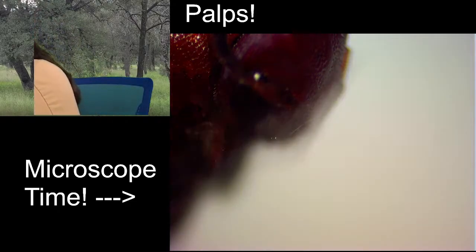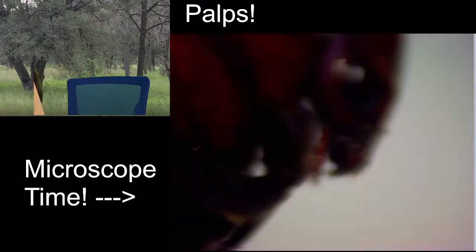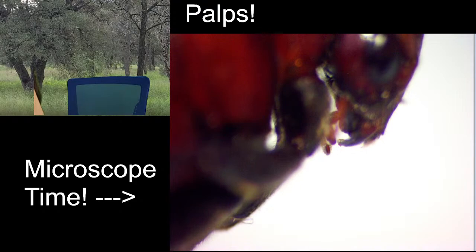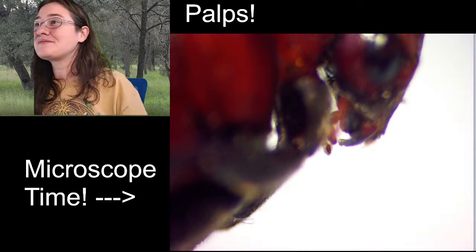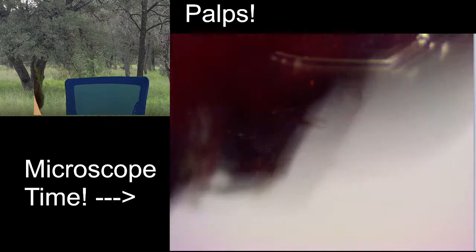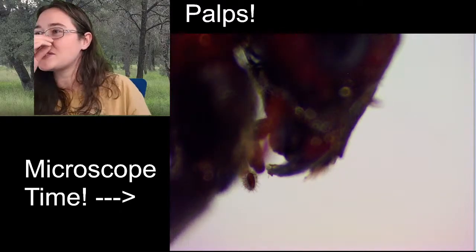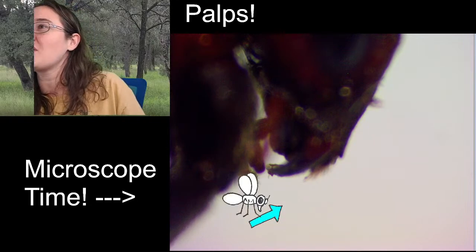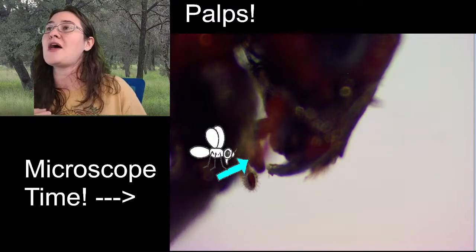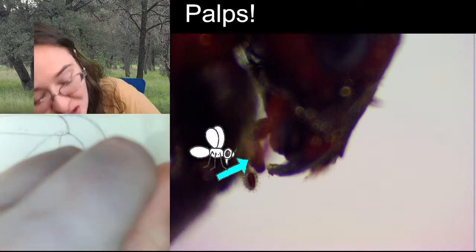So you asked if those were mandibles in the front. I found the labial palps. They're itty bitty. Alright, so you have to kind of almost imagine that they're there, but I promise you, if you look right around here, there's this little segment coming out this way, and then one more segment out this way. The labial palps are going to be the palps that are actually connected to the bottom jaw of the insect's mouth part, and they are 2-segmented.